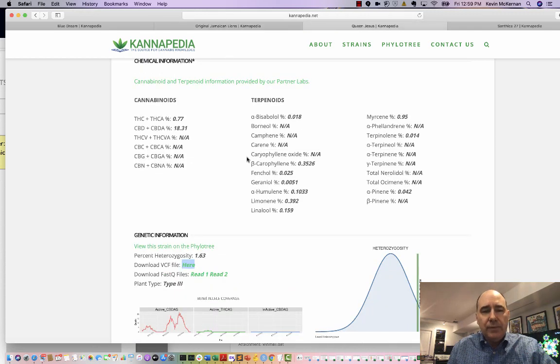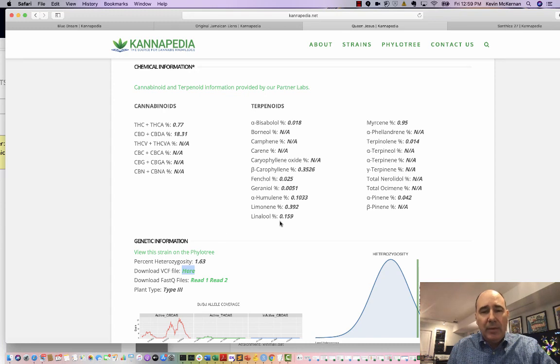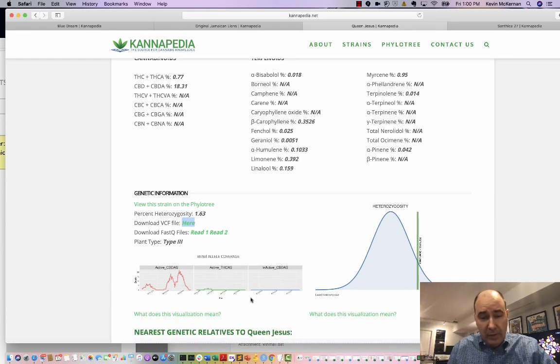Let's take a look at Queen Jesus. Queen Jesus is an interesting one that we've sequenced. It has a chemotype in the database, and you'll notice it doesn't make any cannabichromene. What we've also noticed is that we need to add another plot here to look at the cannabichromene genes, because we do in fact cover those in your Strainseek report, and you would find that in this VCF file. If you went and looked for cannabichromene, there are 8 of those genes on contig 756. And you can chart the coverage over those genes to determine whether you have a cannabichromene deletion and get a plot just like this for cannabichromene.